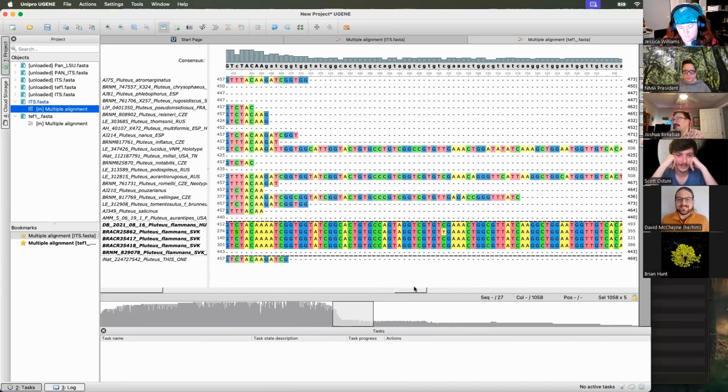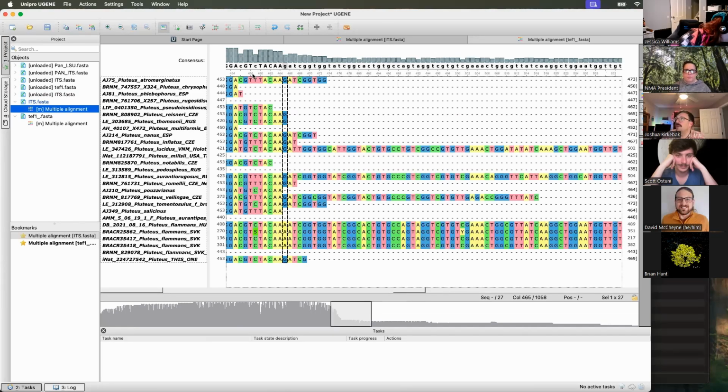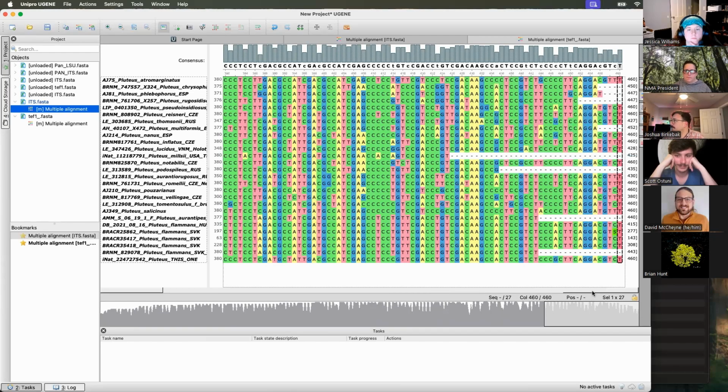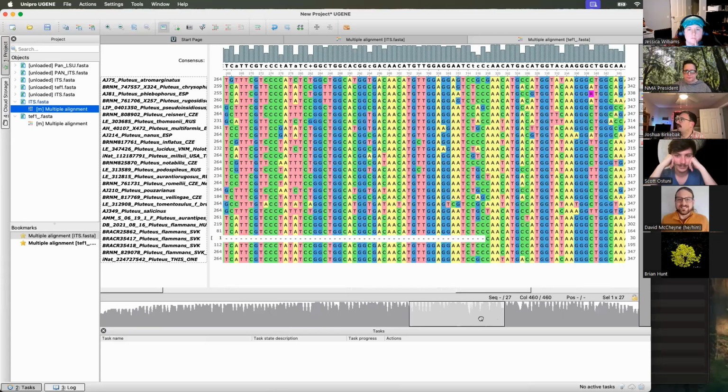And these overlap a little bit, but when you have a ton of extra data for only a few sequences, the tree algorithms have trouble with that. So you don't want to have things be too imbalanced, even if you do have data for a bunch of them. It's not good data, and it's going to cause some algorithmic noise. So I'm going to trim it pretty conservatively all the way back here. And then here we can see our nice little triplet pattern, right?